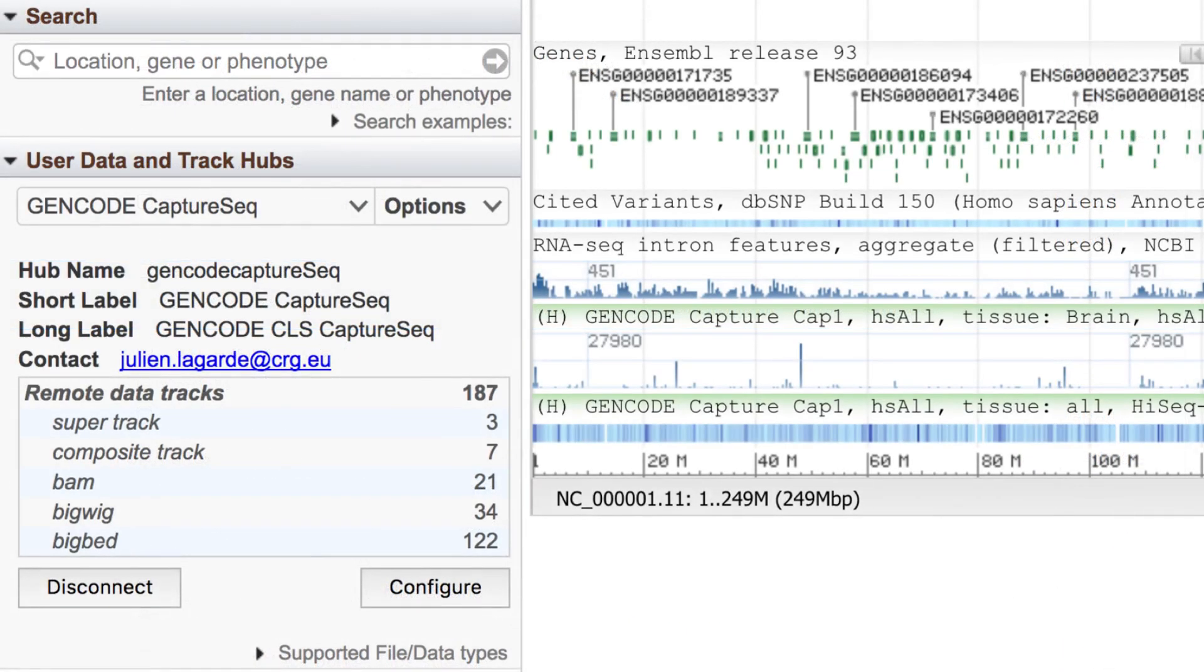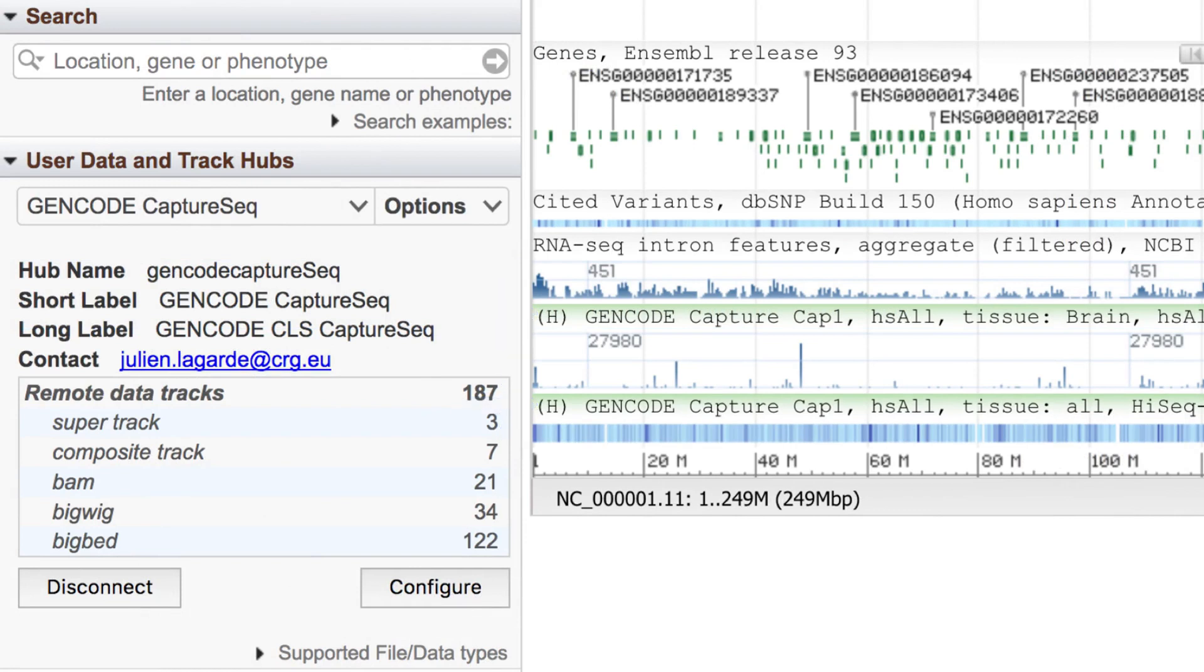You can recognize the tracks that come from sources external to NCBI, like these TrackHubs, by the green highlight in their label.